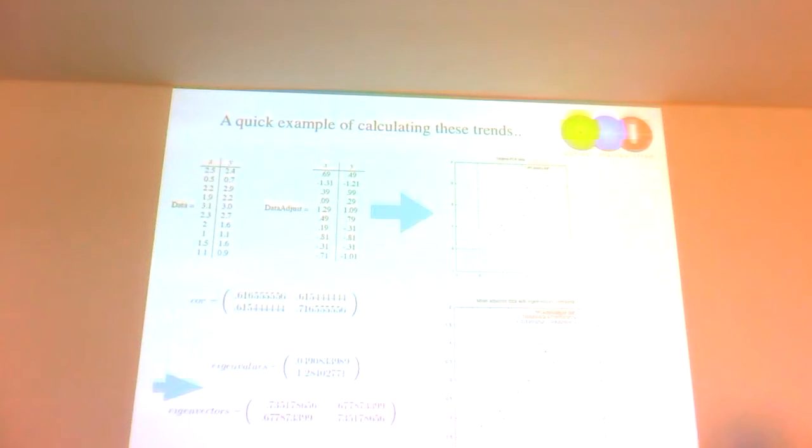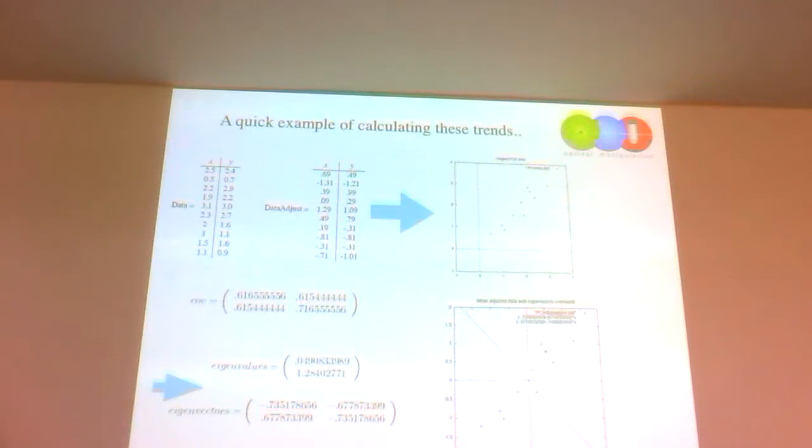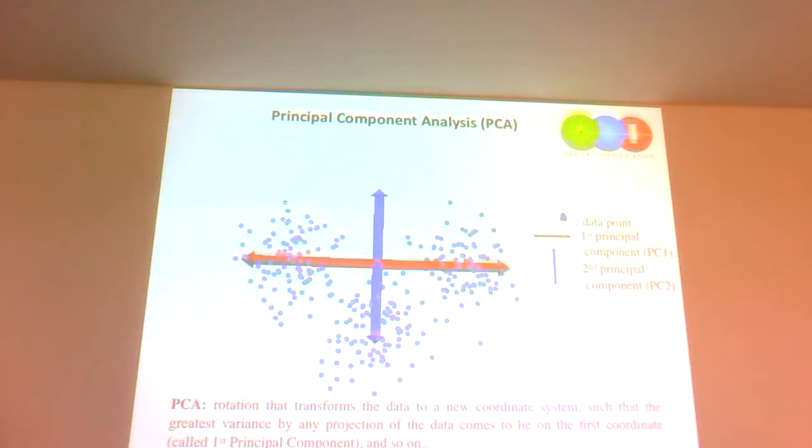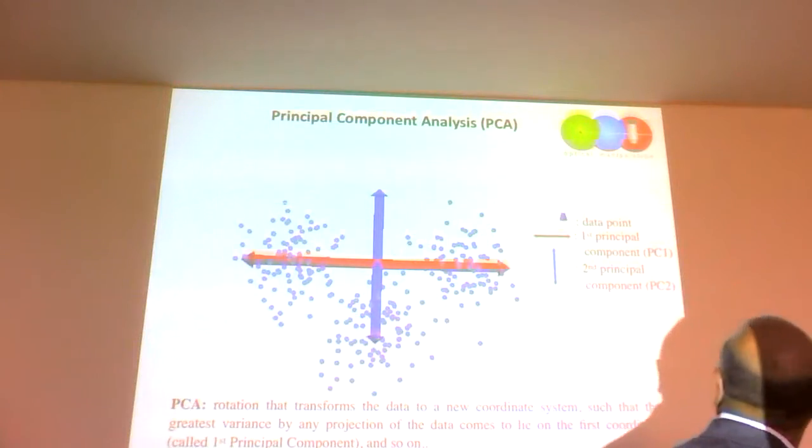But what it does allow me to do is take data sets that are very close and look for the maximal variances. So each of the principal components tells me the biggest change. Now, it turns out if you do Raman, probably your biggest change is going to be the fluorescence. So PC1 picks up the fluorescence. Then it might be something like the histones, perhaps. Then it might be the lipids. And so then it goes down and picks up all those subtle differences without you having to scrutinize the data. So it's very, very robust and very nice and reproducible. So there we go. That's me rotating data sets to do that for these two components. All right? From a Raman spectrum.